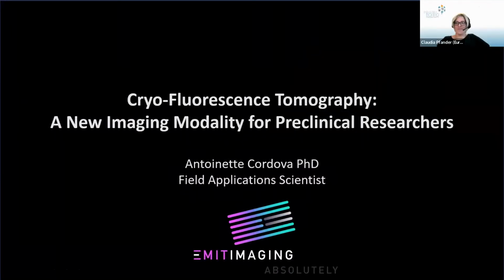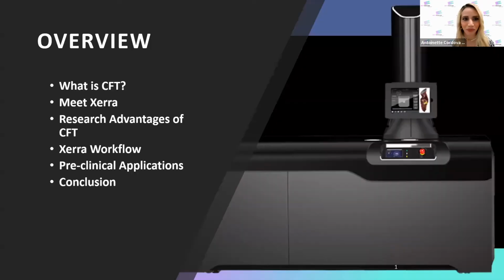As Claudia mentioned, today I'm going to be speaking about cryofluorescence tomography. We're going to focus on how this is a new imaging modality for preclinical research. And the goals of the talk for today are how CFT could optimize your imaging workflows with high resolution and quantitative fluorescence data.